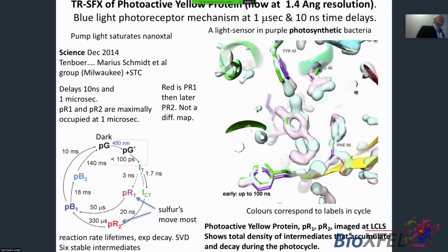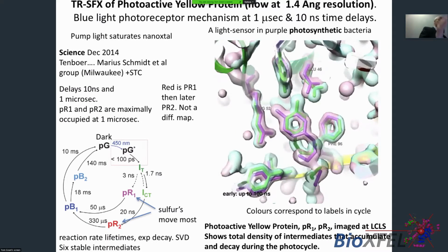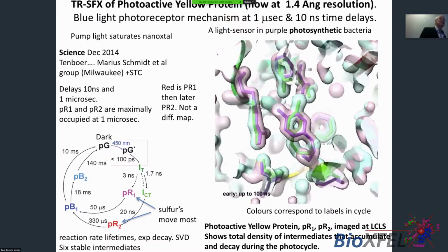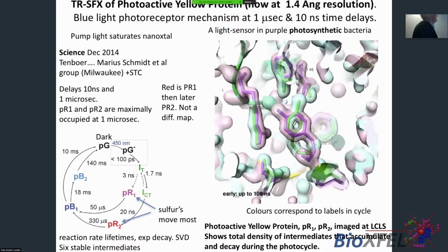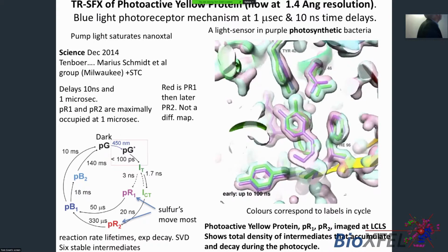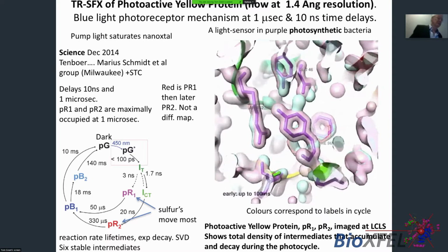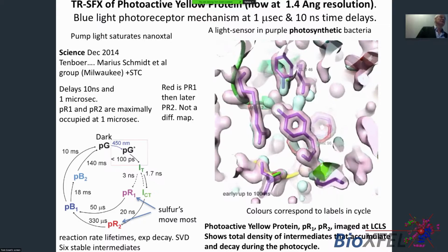Now, in photosynthesis, there's another similar cycle. It's called the Kok cycle, where similar things happen. Those crystals are much harder to get high resolution from, but there's analogous work going on in Petra Fromme's group for photosystem 1 and 2. So this is the best we've been able to do towards a molecular movie, and I think it's absolutely remarkable.